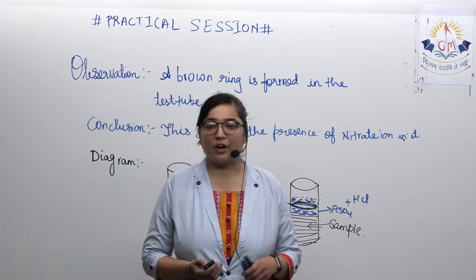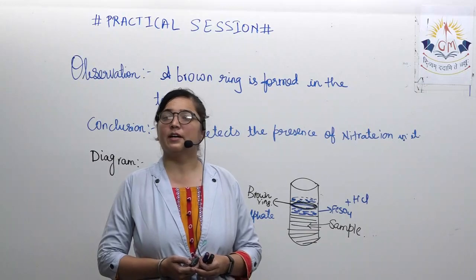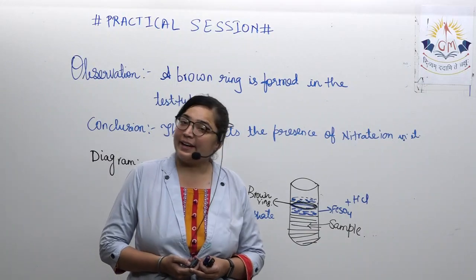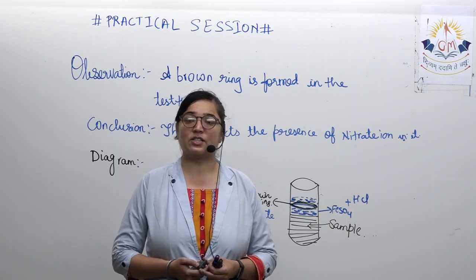So I hope you are clear with the content, and that's all for detecting the presence of nitrate in a particular solution.